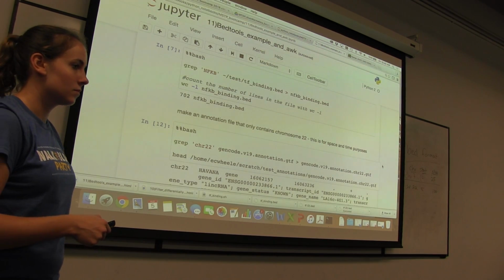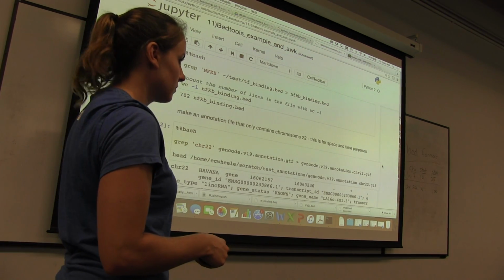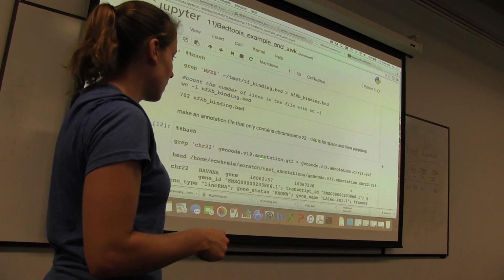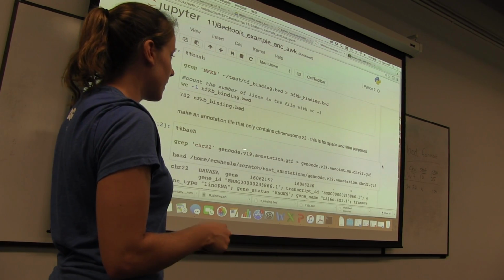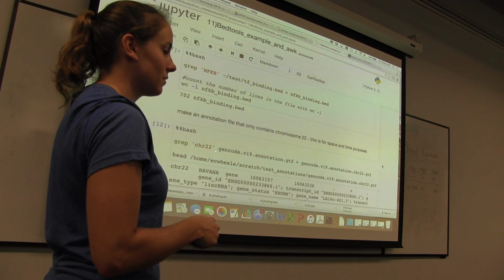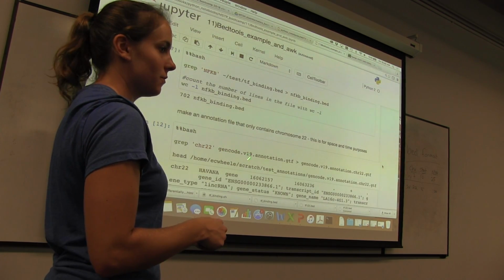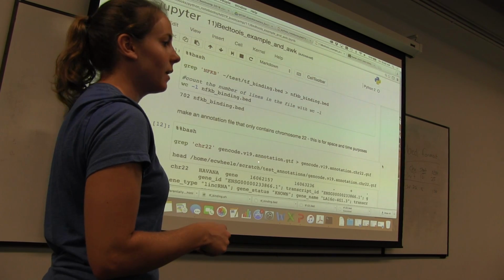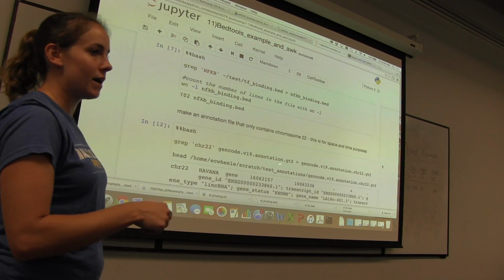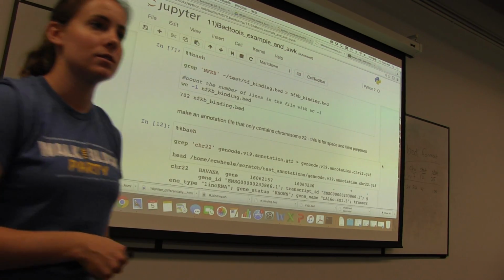Get ourselves into the annotation of HG19 from this command here. Well, if you're grepping for a file and you're not in that folder, is it going to find it? But you could also provide a full path. And it would find it. Yep. Same type of thing. Same rules apply. Full paths or being in folders.